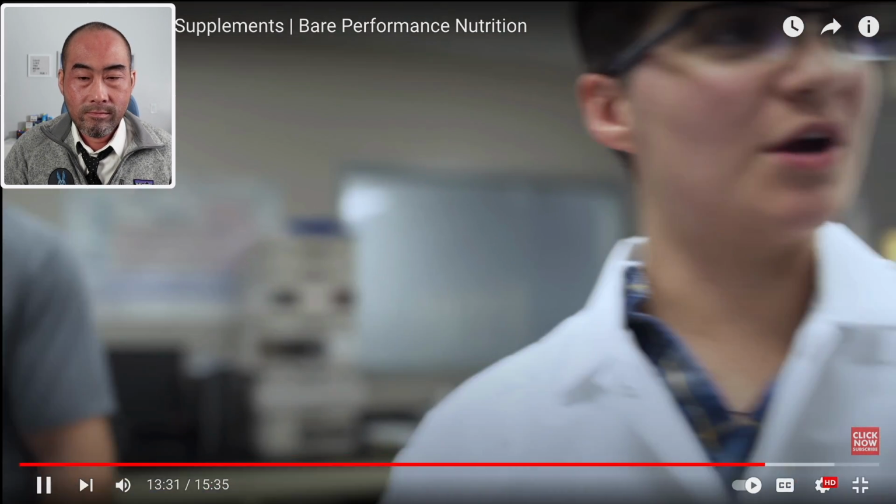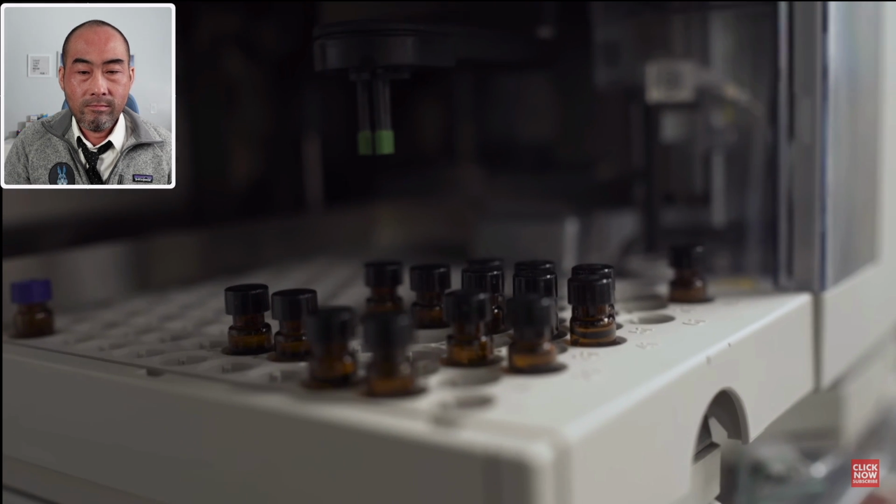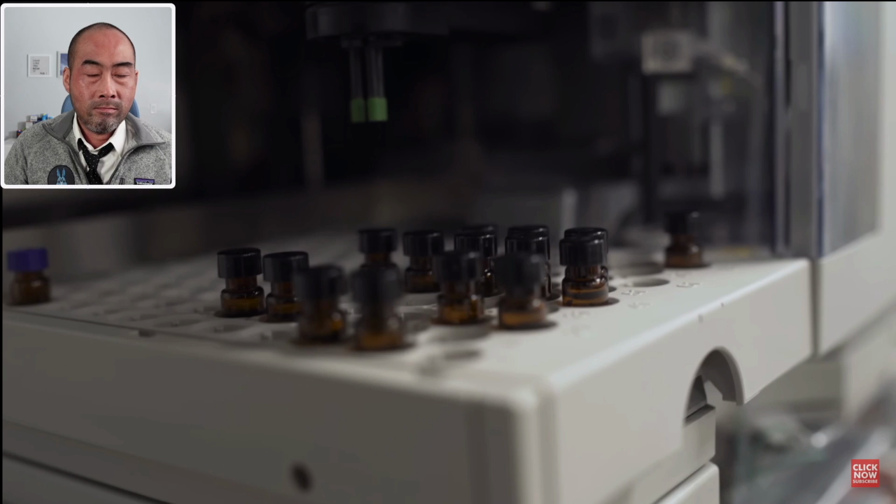Other thing I want to highlight would be our HPLCs. These are good for quantification. So again, when I said we not only ID the material, whether it's a raw, finished good, or even an in-process sample, we like to identify and quantify various aspects about it. So both of these are running, we have a third one over there, and that'll quantify whether it's your label claim, say 200 milligrams of caffeine per serving, or if it's just a raw material and we want to make sure before we buy it from that manufacturer that it is 99.9% caffeine, creatine, that sort of thing.